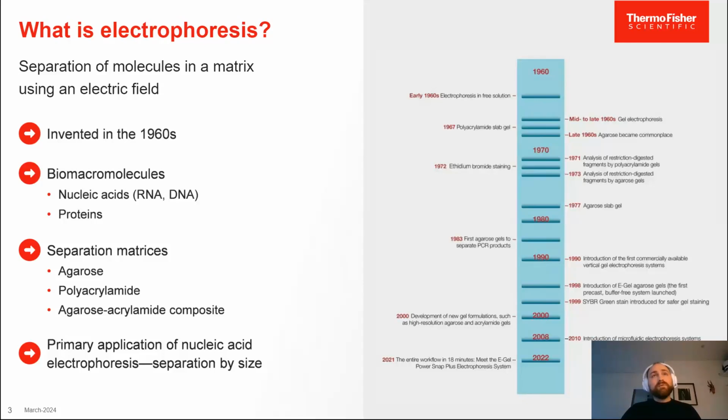And while agar increased in usage over a period of time, a purified version called agarose became the dominant matrix for nucleic acid separation specifically. It kind of remained the status quo for a very long time, basically until today. There are other types of matrices also used in nucleic acid separation, say polyacrylamide, but it's not as widespread and it's more for a very specific use.